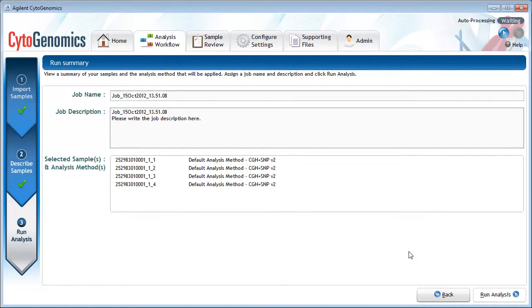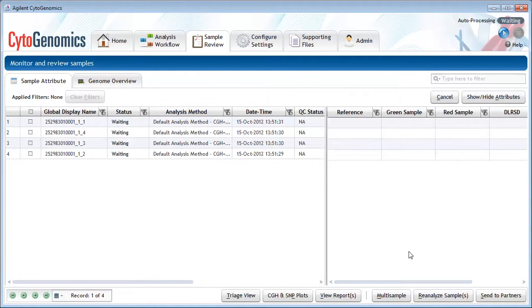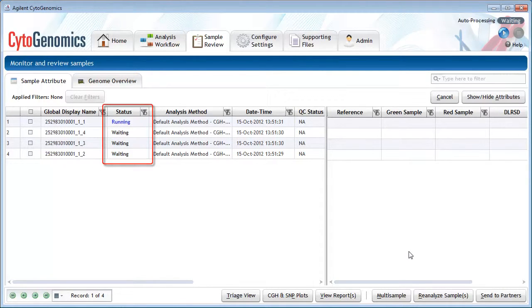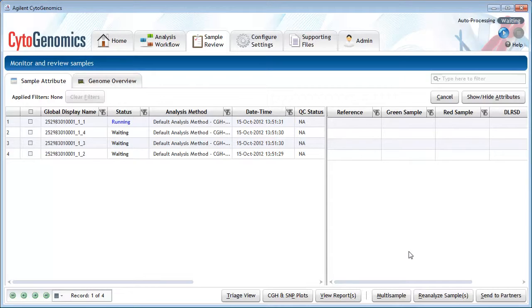The program automatically takes you to the Sample Review screen and your samples are listed in the table. Right now the workflows are still in progress. When a workflow is complete, the status column updates to Completed and you will be able to review the data from that analysis. See the video tutorial on sample triage for more information on reviewing samples.